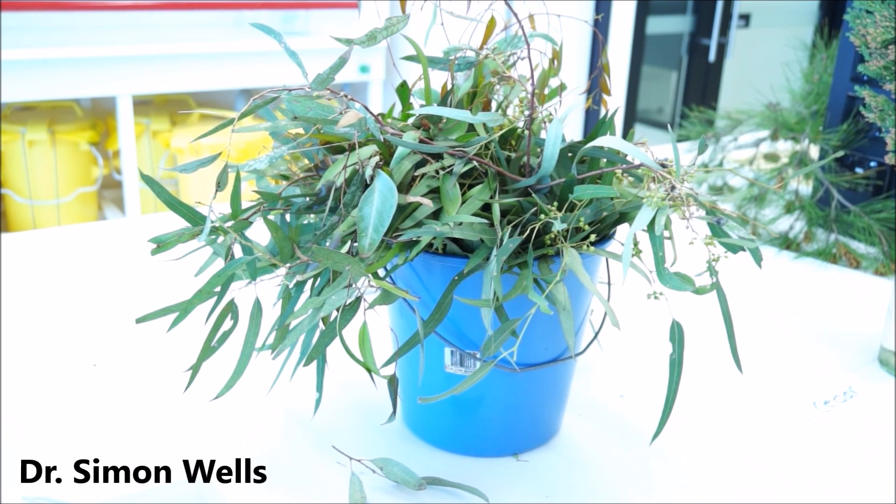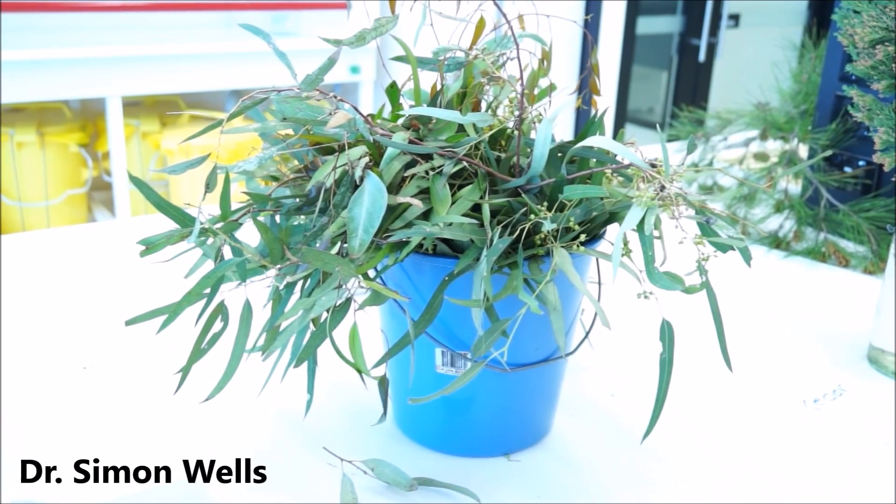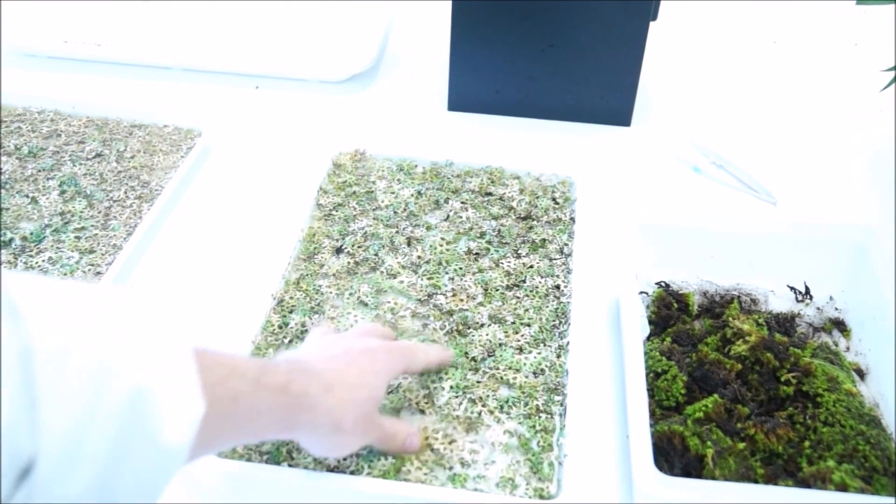PRAC 3 will examine water loss in three different species. One of them is the eucalypt, another one is moss right here, and another one you've met in PRAC 2 is lichen.